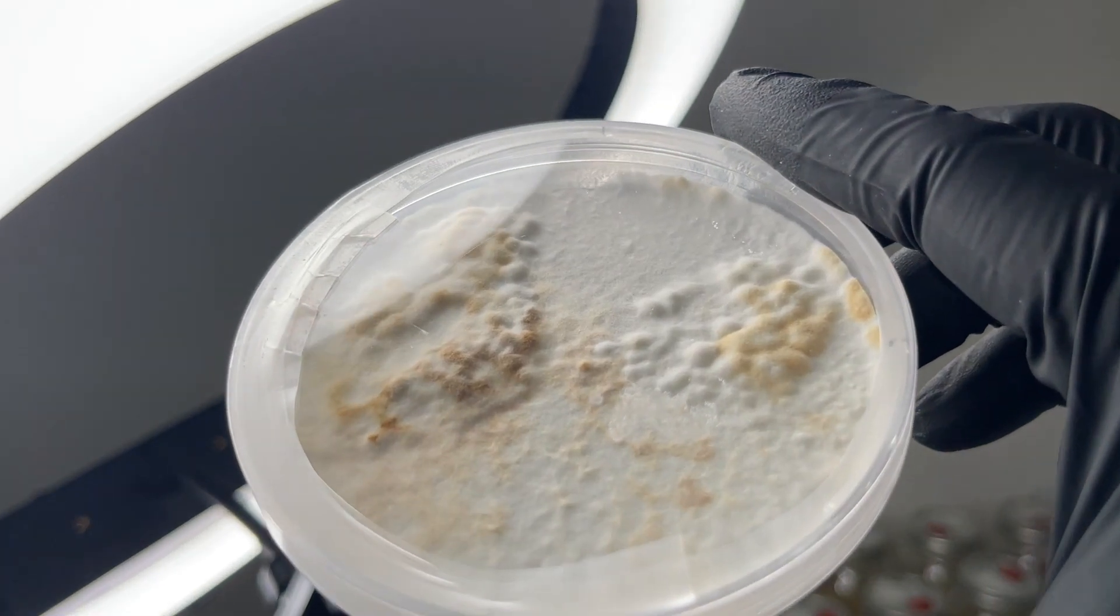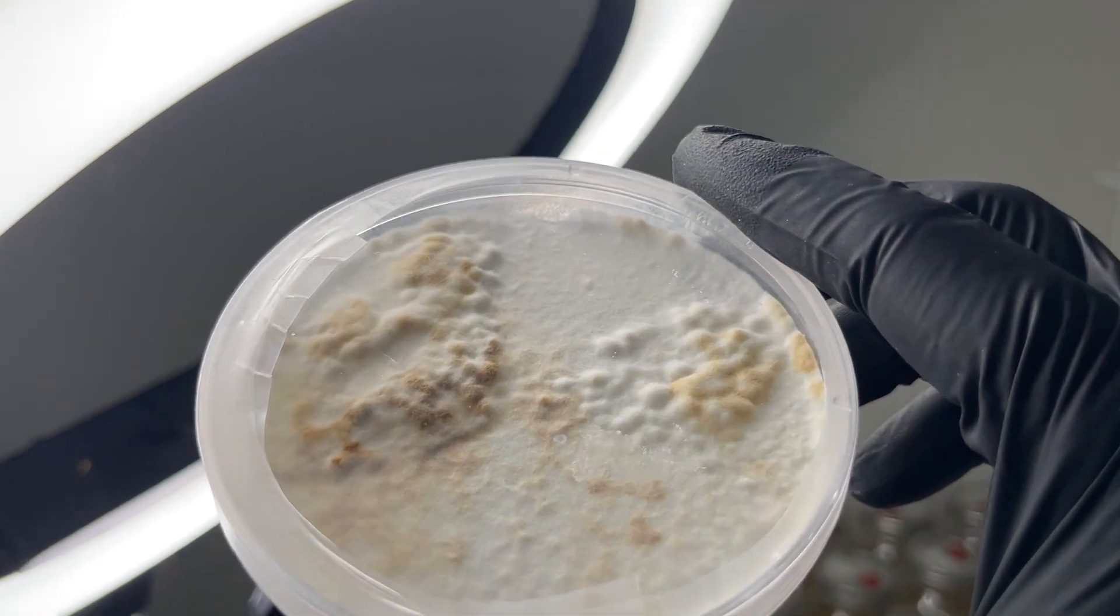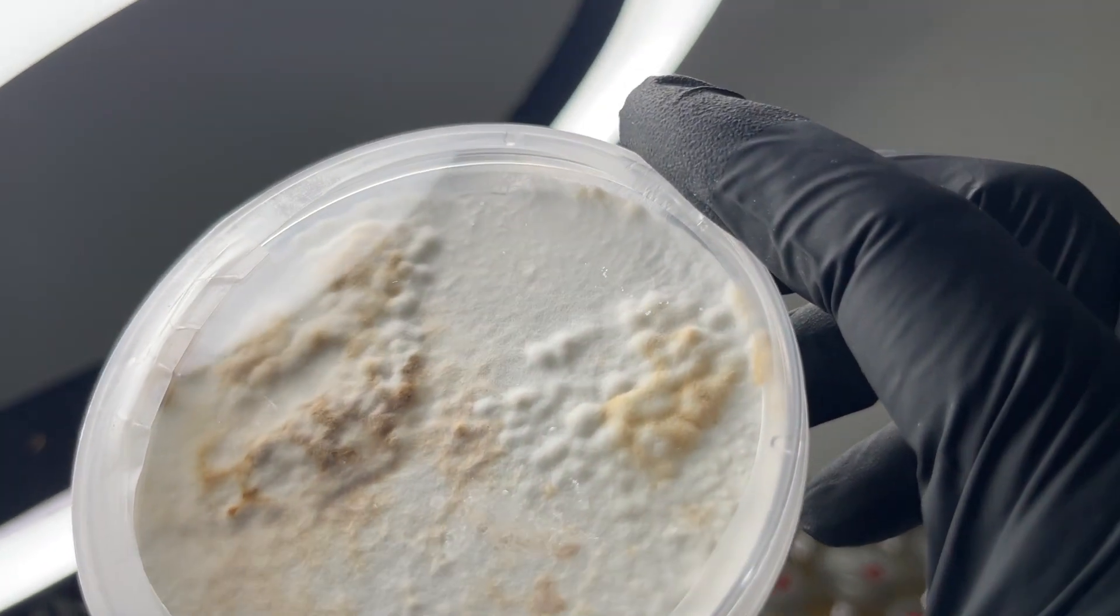This is shiitake on an agar plate and you can see it starting to popcorn and brown. If you check out my most recent video, you can see how shiitake fruits.